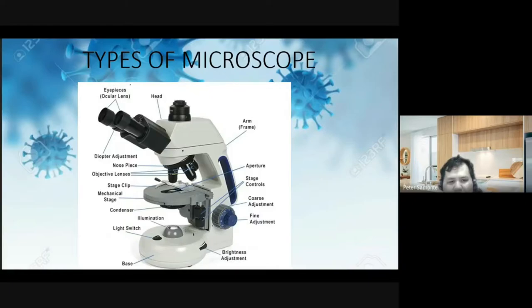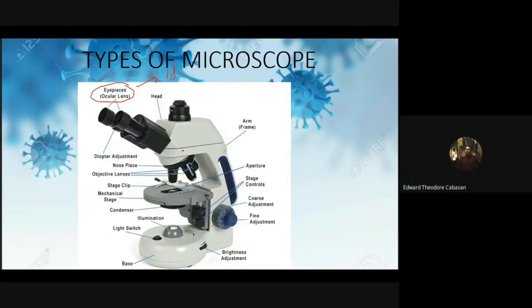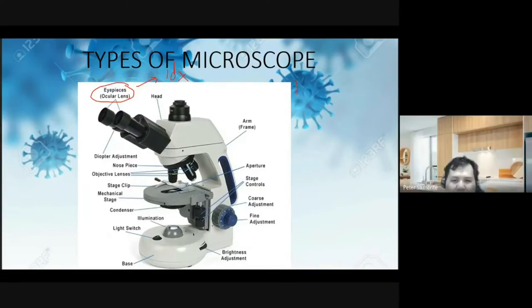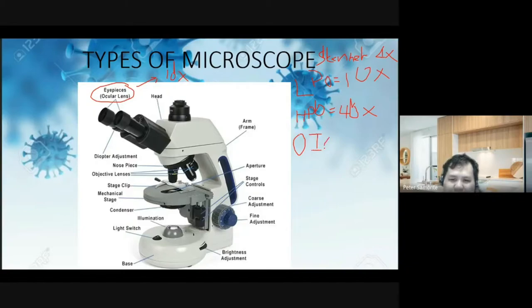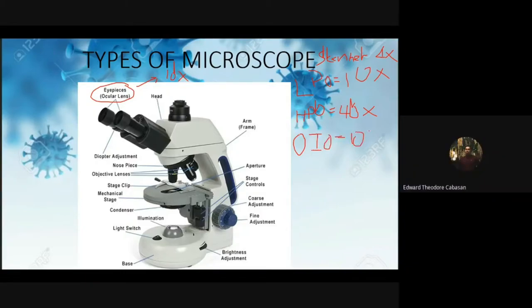Now, can anyone tell me the magnification of your eyepiece? Do you still remember? 10 times. 10 times, sir. All right, so 10 times, very good. Can you tell me the magnification of your LPO? What's the magnification of your low-power objective? 10 times. Okay. How about for your HPO? 40. Okay. How about your scanner? Four times. How about your OIO, your oil immersion objective? All right.